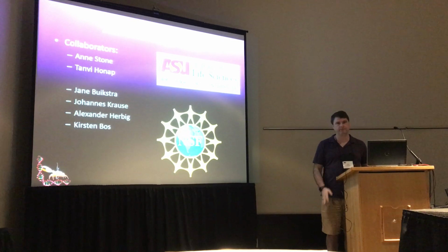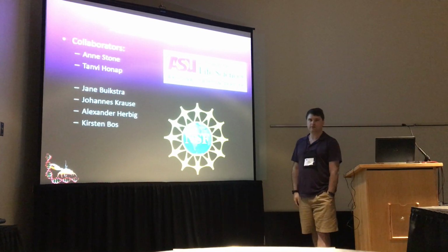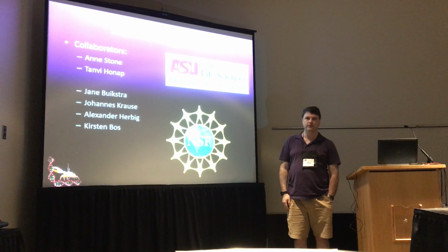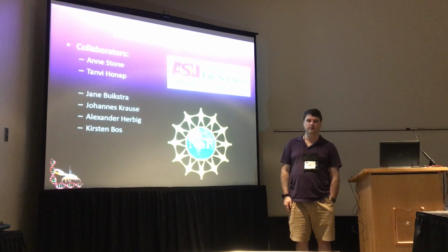Mike? Yeah. Have you tried playing with that with higher k-mer values just to see what happens? Because normally when you do assemblies, you're usually using larger k-mers.